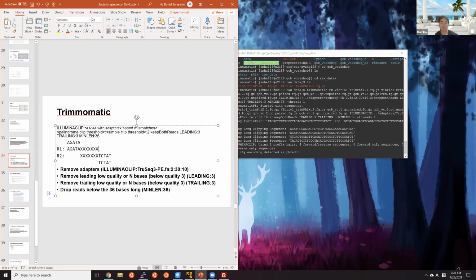So what happens is, with Illumina data, the quality kind of gets dropped as you go to the end of the reads. So it's gonna trim most of the end part, but you still get some regions left to get overlapped with the second reverse reads.